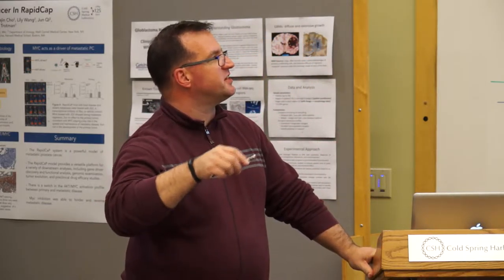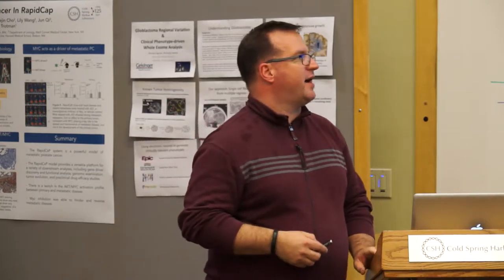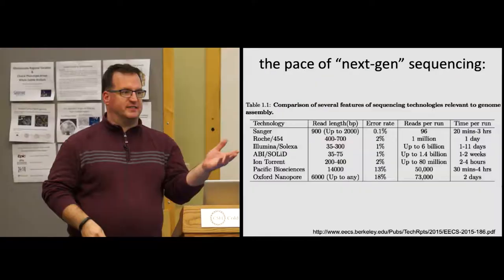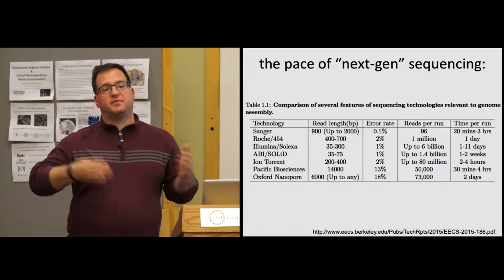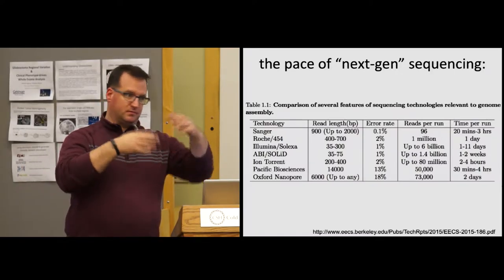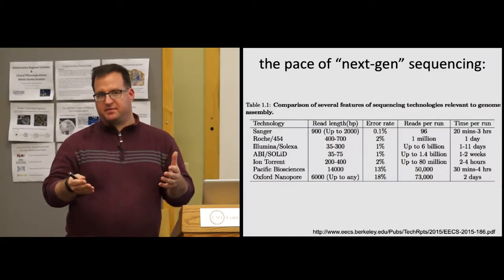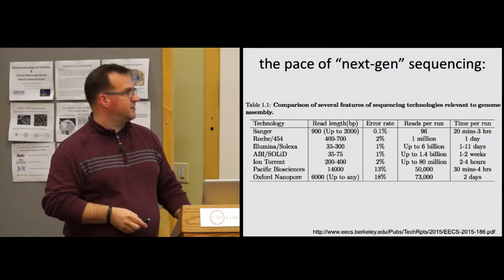Okay, and so here's just another way of looking at that in a tabular form and just giving you some numbers. People like to talk a lot about how long it takes to get a particular amount of sequence. I've always found this a little bit artificial. I'm happy to wait 2 weeks to get sequenced because it's going to take me another 6 months to analyze it and think about it and go to the next step anyway. So whether something is done in a day or it's done in 2 weeks is something that a large-scale sequencing center, or a vendor who has thousands of clients, has to worry about, but it's not something that, as a scientist, I necessarily have to care about.